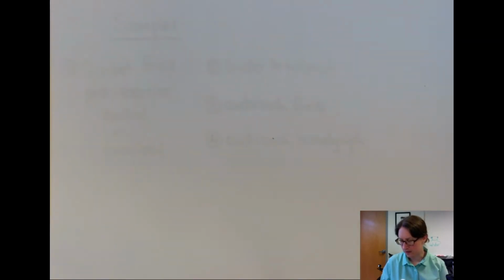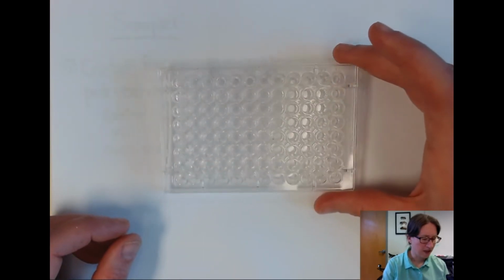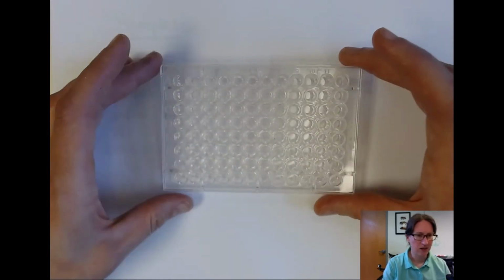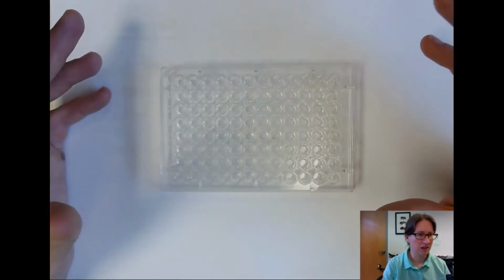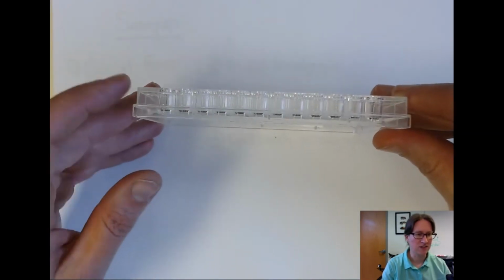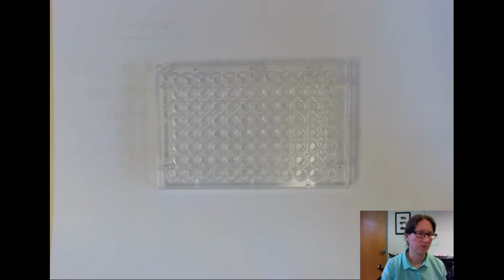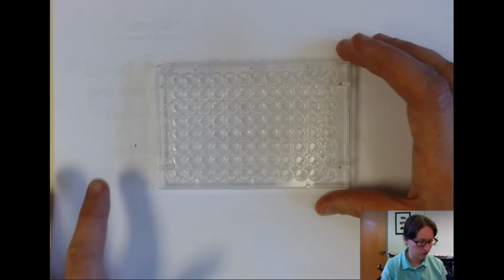And so in recent times, to cut down on the overall costs and to make the process of conducting these assays more efficient, what people have developed are these microwell or microtiter plates to work with instead. So these microtiter plates, the concept is the same as with the cuvette. But if we just look at the volume, each of these holds about 200 microliters instead of needing the 400 to 600 microliters that a standard cuvette would require.